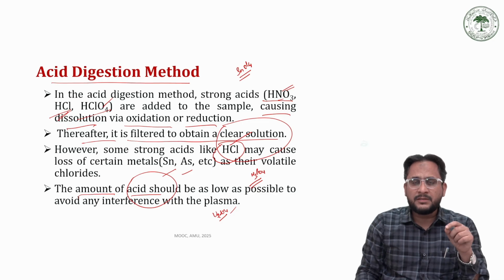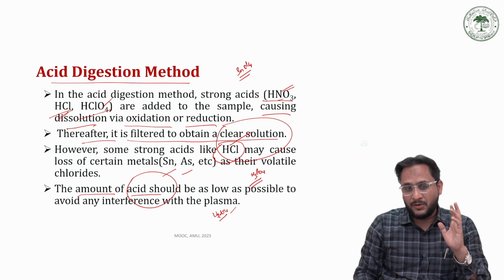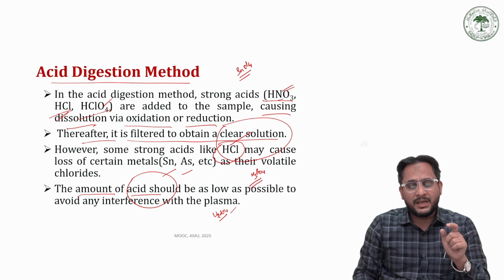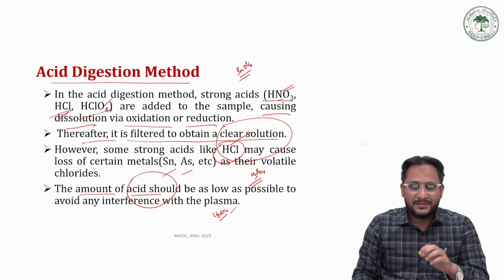But on the other hand, the amount of acid should not be very low either, because if the amount of acid is low, the possibility of complete digestion will be lost, and if the digestion is not complete, the actual concentration can never be detected, and we again compromise the quantitative analysis of our samples.